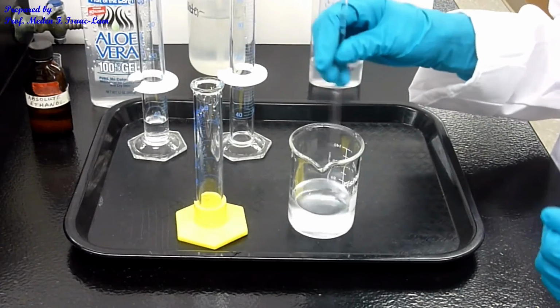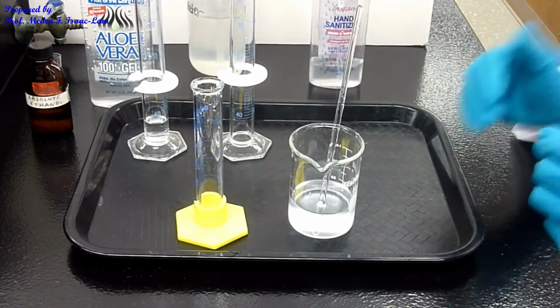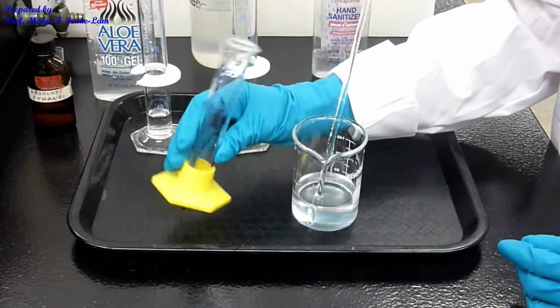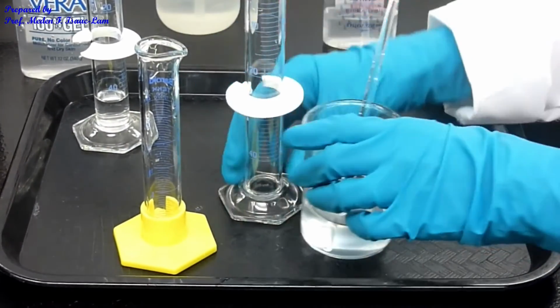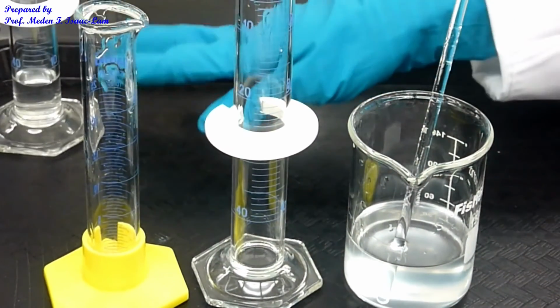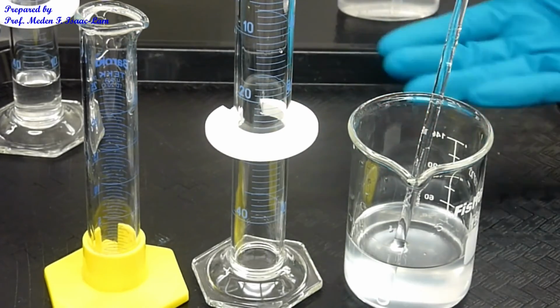This is now the hand sanitizer. As you can see, it's a little bit turbid. There's some turbidity to it. So I put everything in, the aloe vera gel that I measured, 7 ml, and then the 43 ml of the solution that we made in part A. This is the remainder, so I can actually use that too, because that's an antibacterial ethanol solution in water.